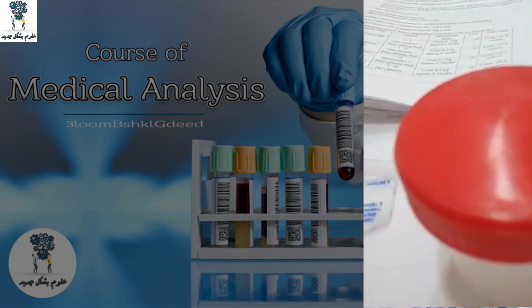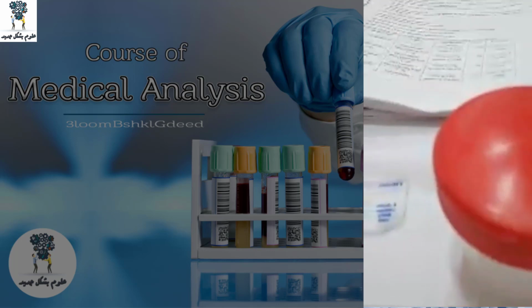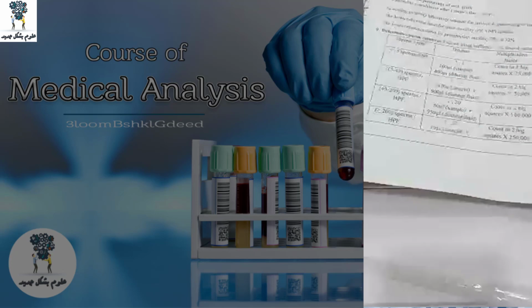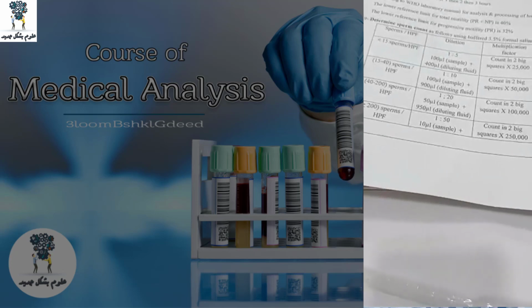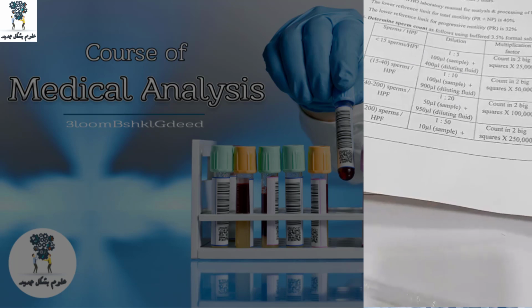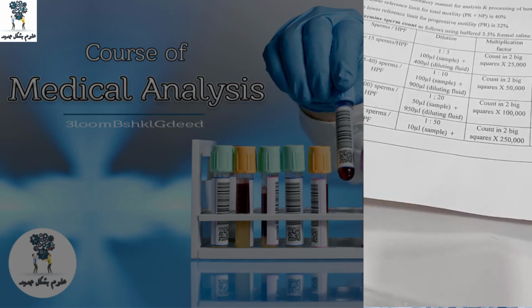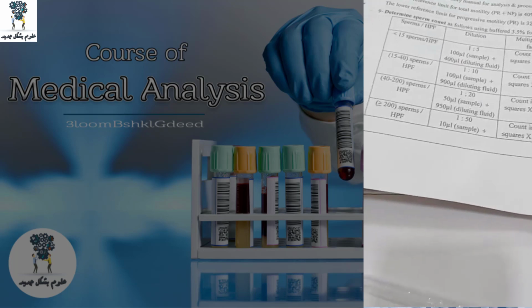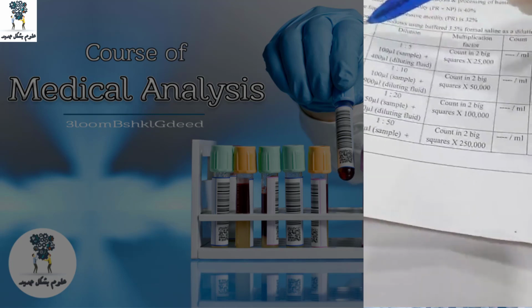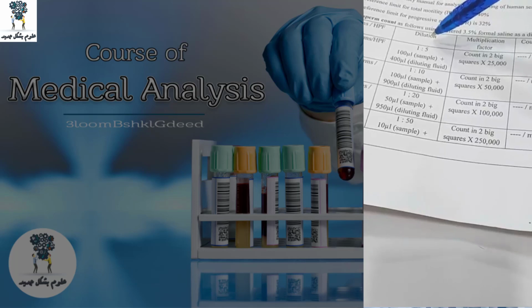So we will make dilution factors. How? There is a schedule, look with me. If you check under the microscope on the normal slide and you find 4 sperm, 5 sperm, 15 sperm, we will look at the first schedule and make the dilution.